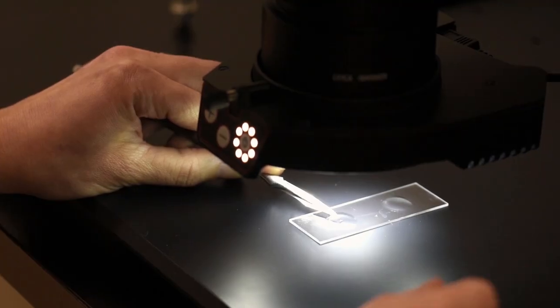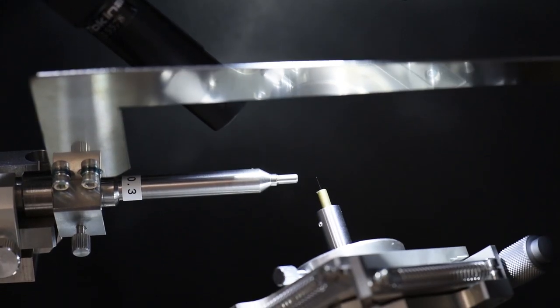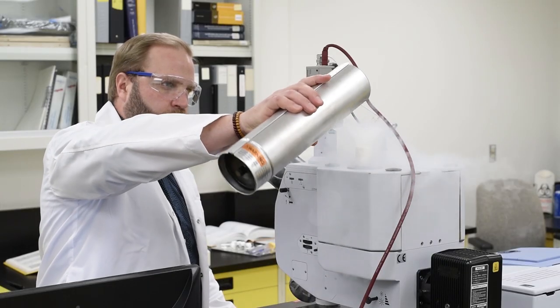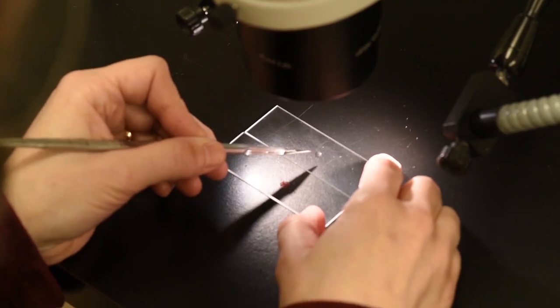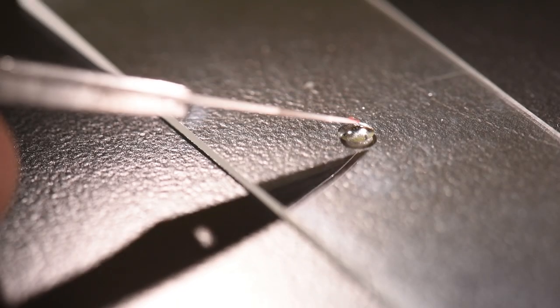The analysis of samples from heritage objects is one of our most widely requested services. The Conservation Science team, made up of scientists and scientific documentation technologists, is here to help you through the process of submitting a sample for analysis.